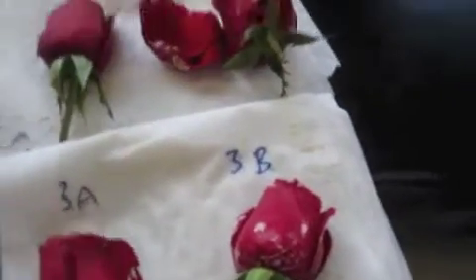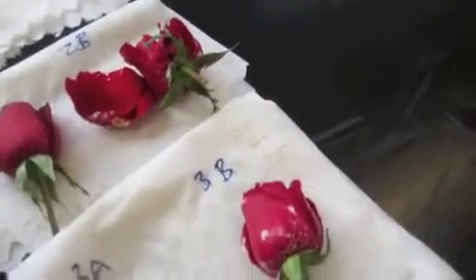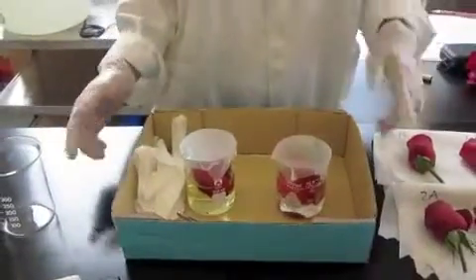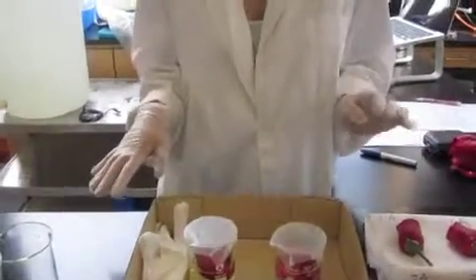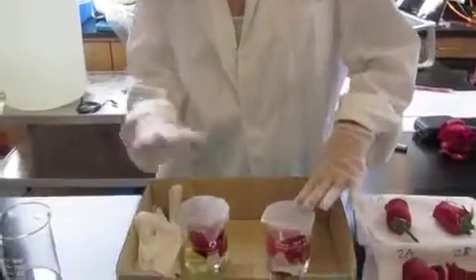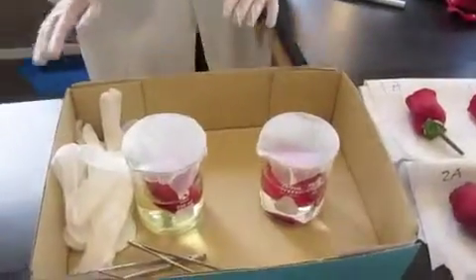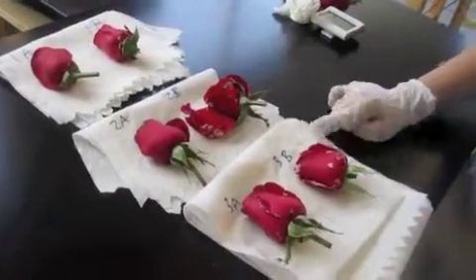However, we decided to do another set of roses, which we're going to keep overnight, so hopefully there will be a more drastic change on that. Okay, so these are our 2 flowers and the beakers that we're going to leave here overnight to see what happens when they react. So this is the beaker with hydrogen peroxide, and this is one of the NaOCl, so we'll just see what happens.